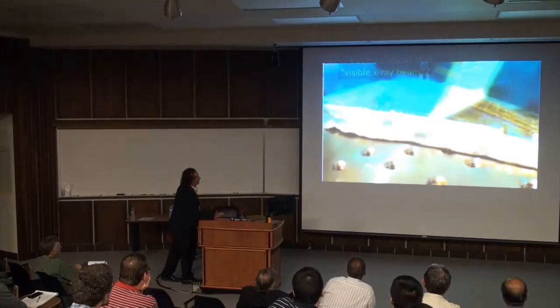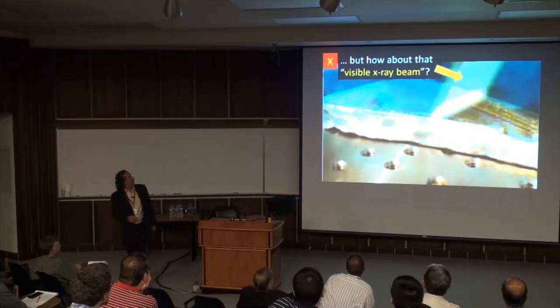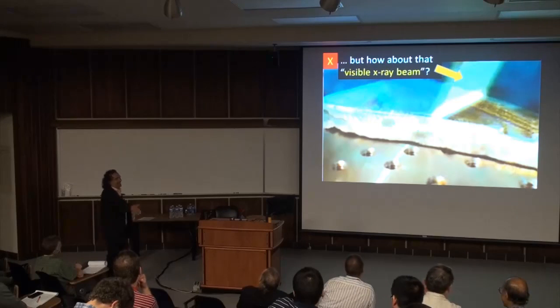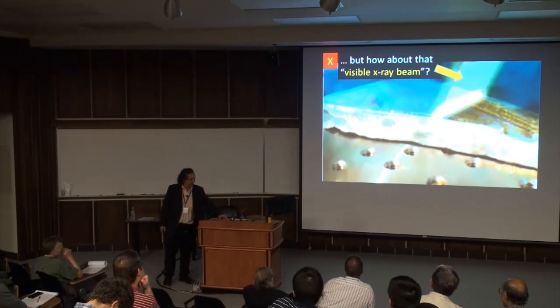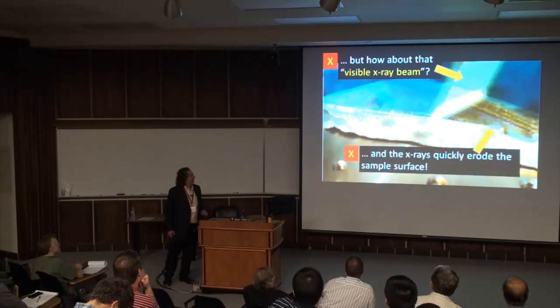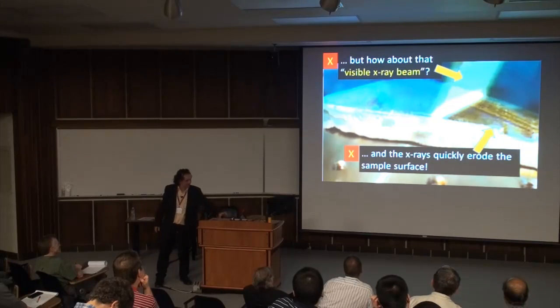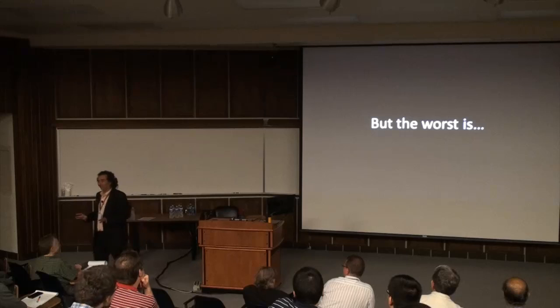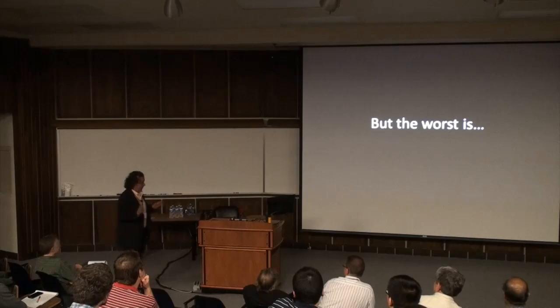Next thing, that's weird. An X-ray beam you can see, and it's actually eroding the sample, you know? See, it's eroding the sample throughout there. All right, but this is not the worst. The worst thing is this.